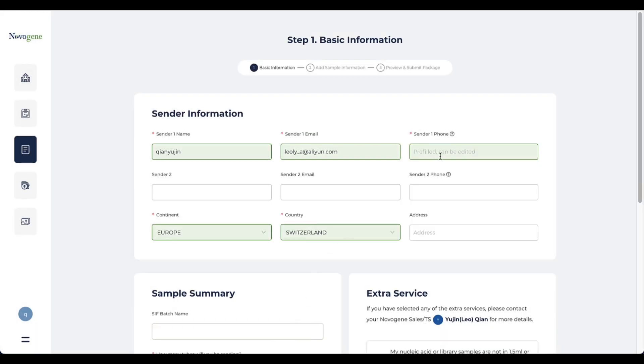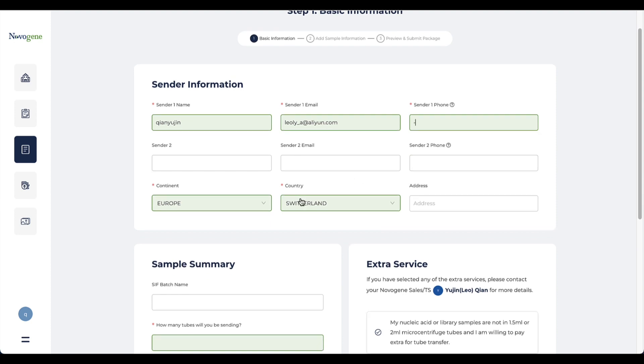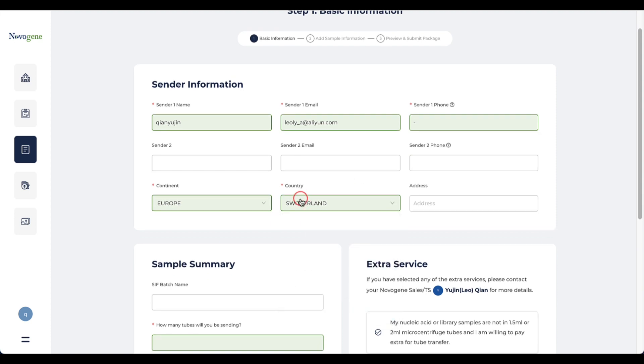On the sender information page, you need to provide contact details including email and your phone number. If the samples were shipped from a different location, you can click the drop-down box and select the correct address.